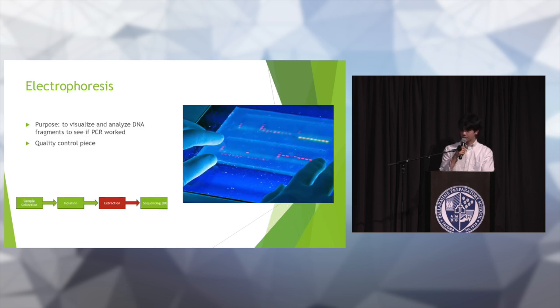Then there is the electrophoresis piece. Essentially, electrophoresis is the separation process to show the strength of how well that specific part of DNA was amplified. First, a gel is made to hold the DNA, and other mixtures are added in order to see the strengths of amplification. These gels are then run at 130 volts, and their colors and brightnesses are viewed.